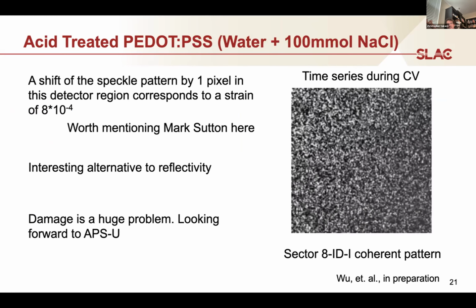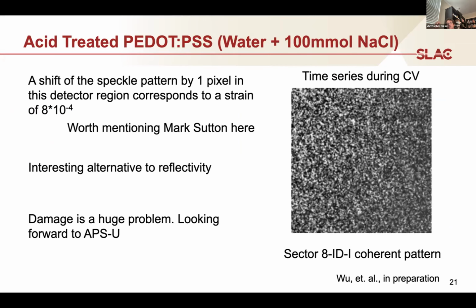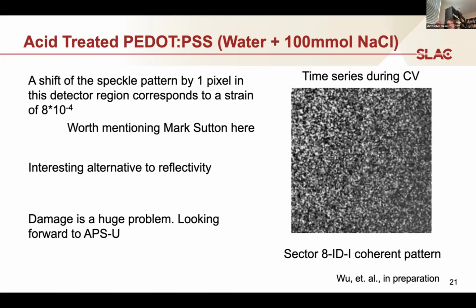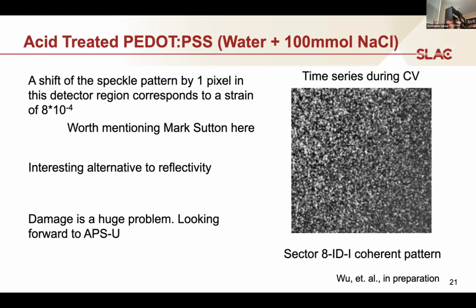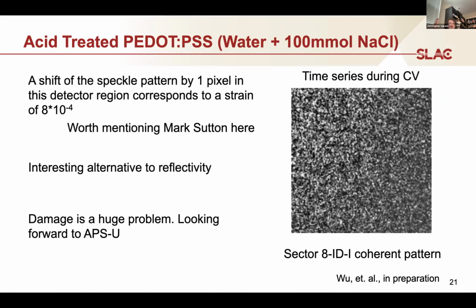I just wanted to highlight that this is a very noisy system. What we're looking at now is computing the localized strain by averaging a few seconds of images, and then estimating the effective strain induced in the material. To me, this is a really amazing opportunity as an alternative to reflectivity in complex systems that are rough.